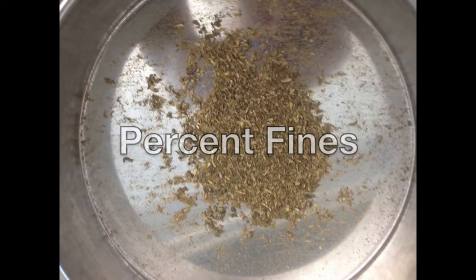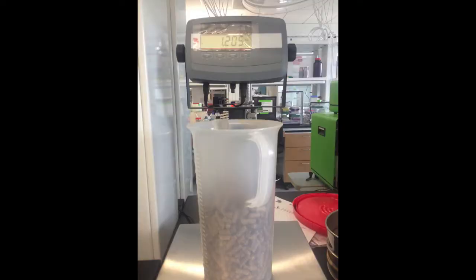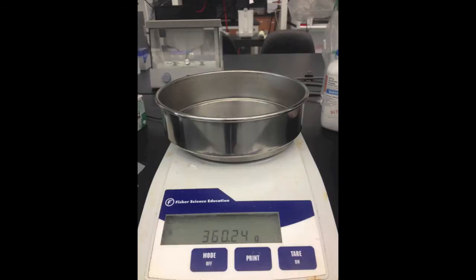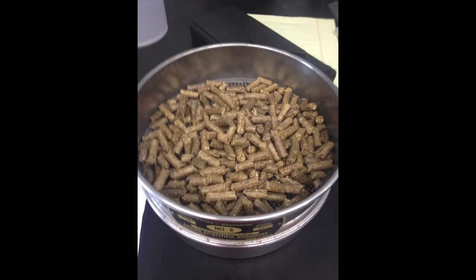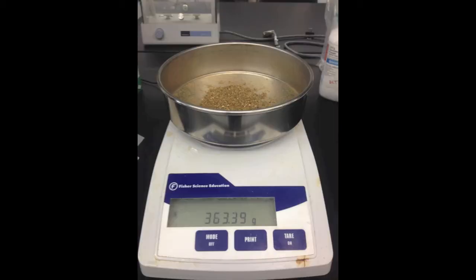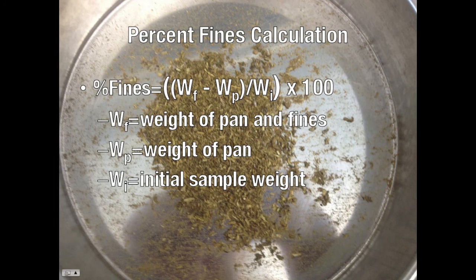Next, you will calculate the percent fines. First, obtain at least 2.5 pounds or about 1.13 kilograms of your densified biomass and weigh the sample in a tared container. Next, find and record the weight of the empty receiving pan. Attach the pan to the sieve and place about 230 grams of your sample in the sieve, or approximately one-fifth of the total sample. Sieve the sample by tilting the sieve side to side 10 times. After the first portion has been sieved, remove the sieve from the pan and remove the pellets. Repeat these steps until the entire sample has been sieved. Then remove the sieve from the receiving pan and weigh the pan and fines. To calculate percent fines, use the equation: percent fines equals weight of receiving pan plus fines minus the weight of the pan, divided by the weight of the total sample, multiplied by 100.